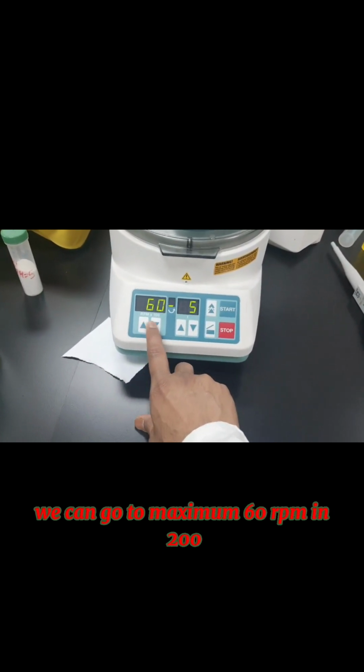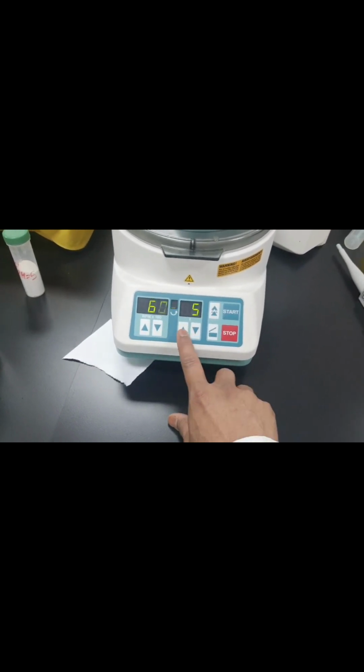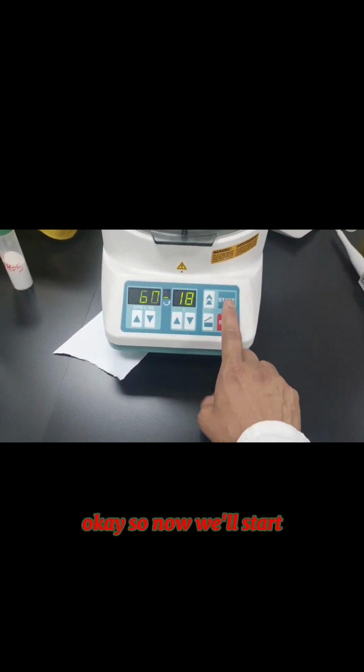So you can see we can go to maximum 60 rpm into 100, and if you want to change the time, you can go up in time here. Also you can change from the settings here. So now we'll start.